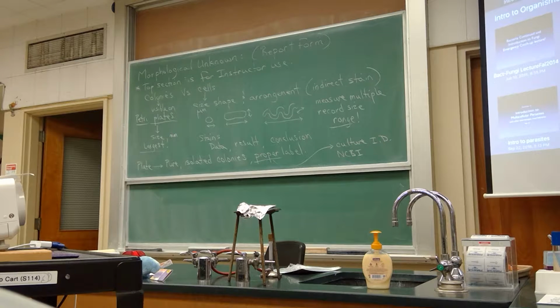For the label, you have to have name, date, medium type. Does it have to be in that order? No. You can put it in any order. Sometimes people write it around the outside edge. That's fine. It doesn't matter where it is or what order it is, as long as it's there. Okay, good. But make sure that your label includes the culture name, genus, and specific epithet.